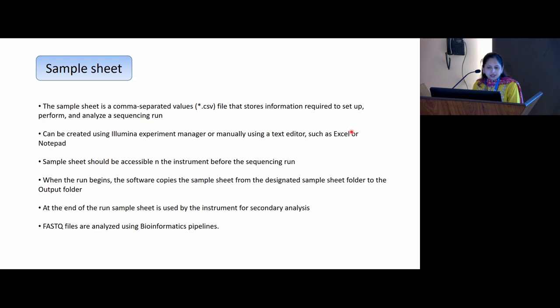When the run begins, the software copies the sample sheet from the designated sample sheet folder to the output folder. At the end of the run, the sample sheet is used by the instrument for secondary analysis, and FASTQ files are analyzed using a bioinformatics pipeline.